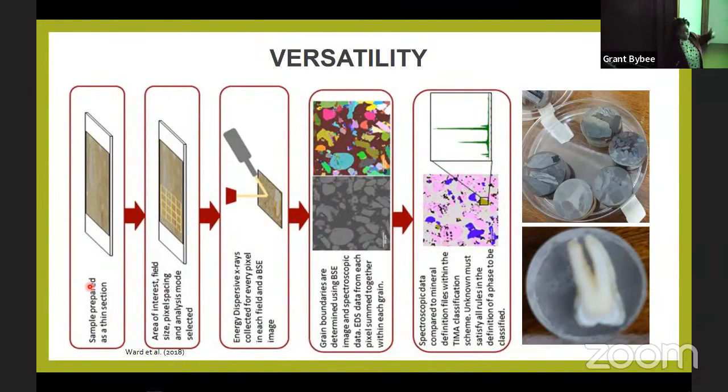And then it's also very important to choose the fields, the width, right? The bigger those fields, the more difficult it becomes to segregate the minerals. It's like those ones are doing mineral liberation. It becomes tricky because it's not easy to segregate the minerals, right?